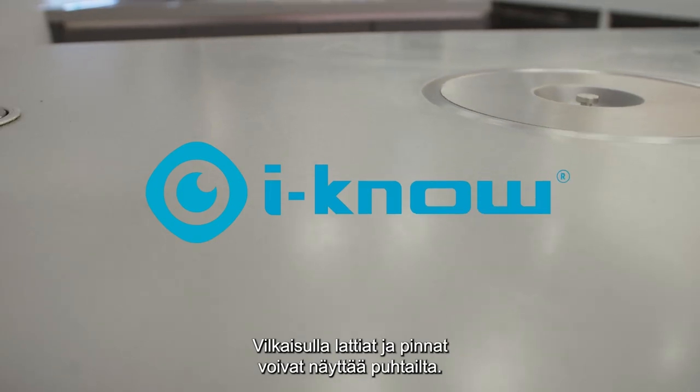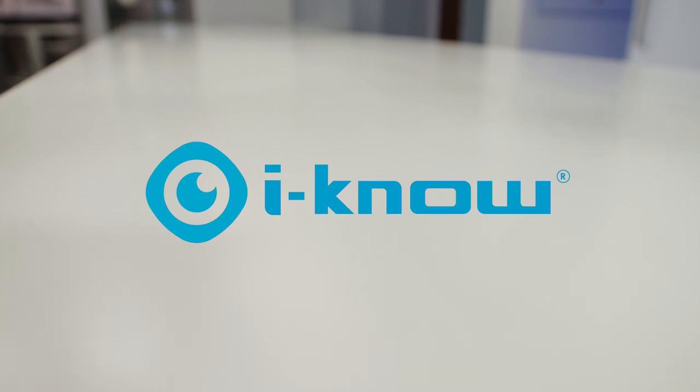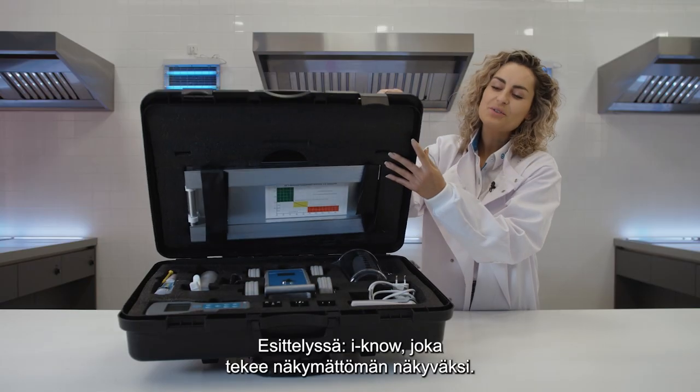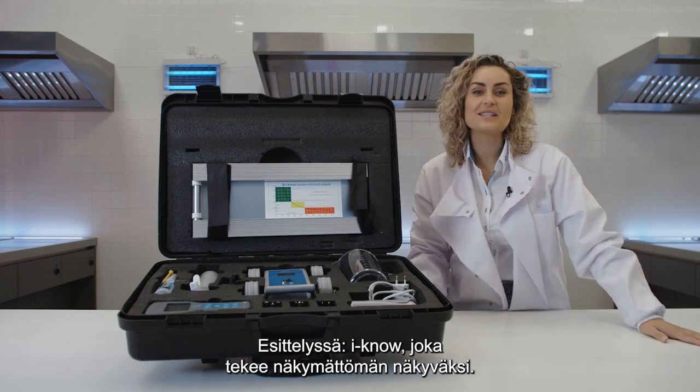Floors and surfaces might look clean, but how can you know for sure? How can you measure what you can't see? Let us introduce you to i-know and make the invisible visible.